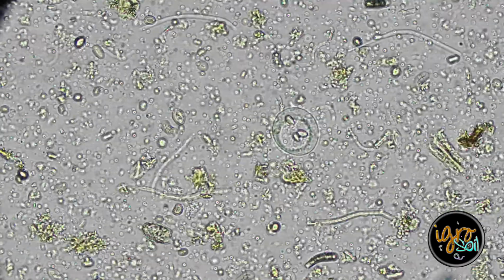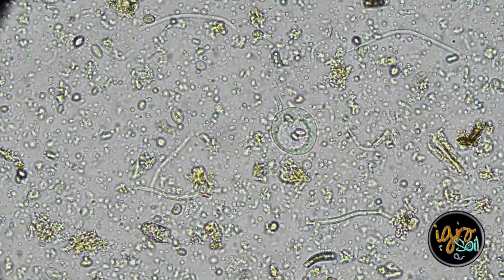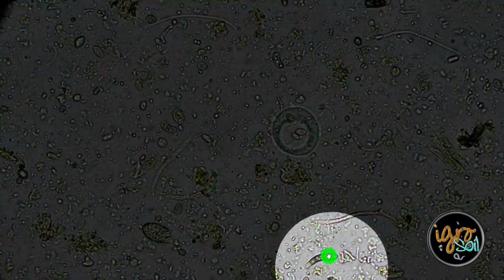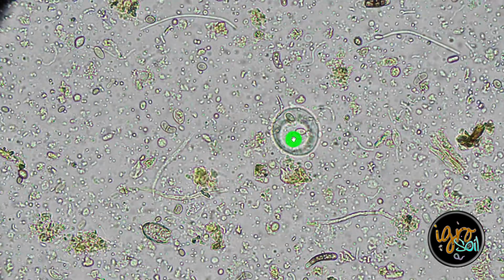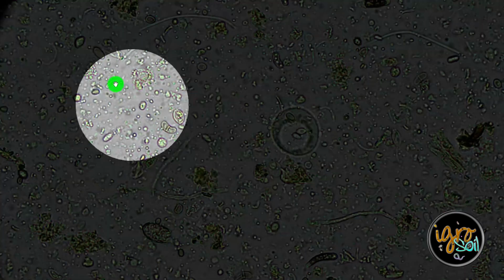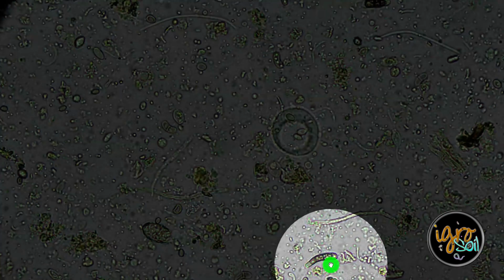What is that, right? That is interesting. I'm not sure what I'm looking at there. That might be a cluster of spores. You see this? So these might be spores. This is definitely a spore here.